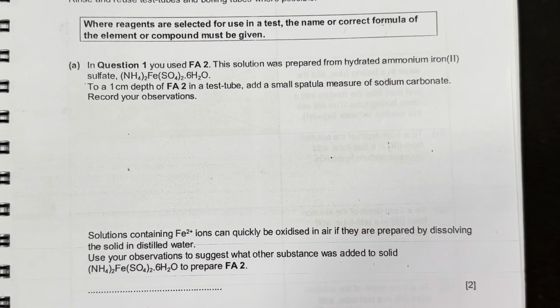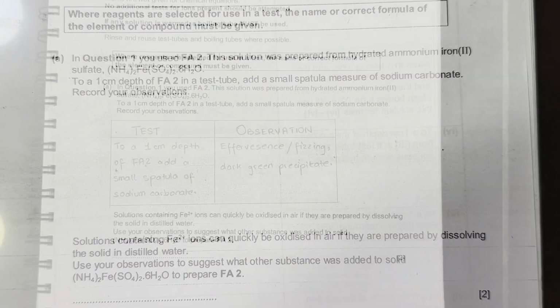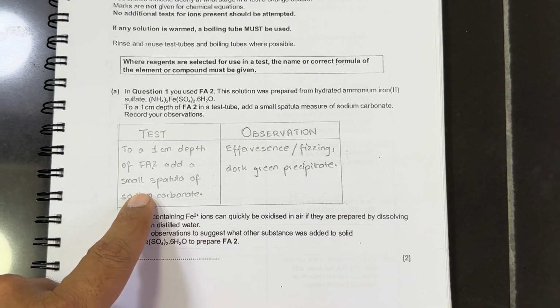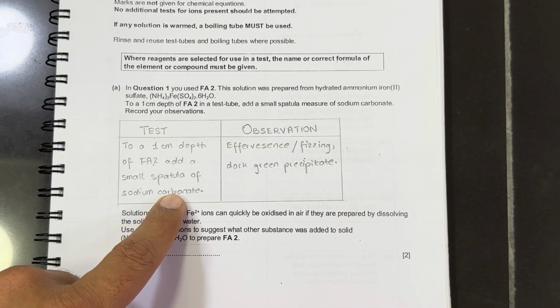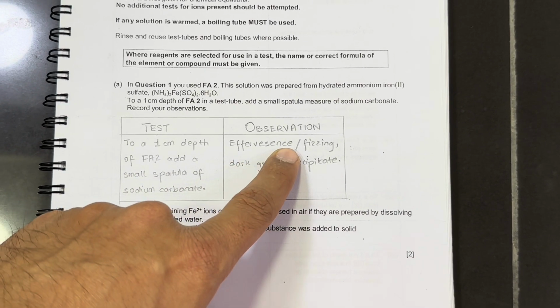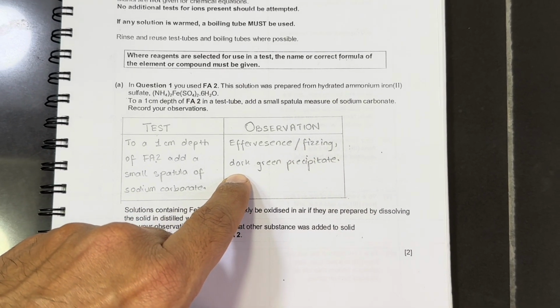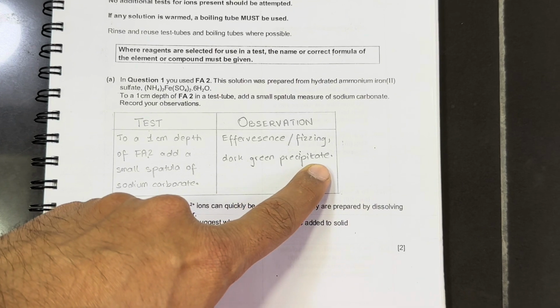Now we'll record this observation here in this space. So here we have recorded that 1 centimeter depth of Fa2 is when added with sodium carbonate powder, effervescence or fizzing appeared, and that solution turned into dark green precipitates.